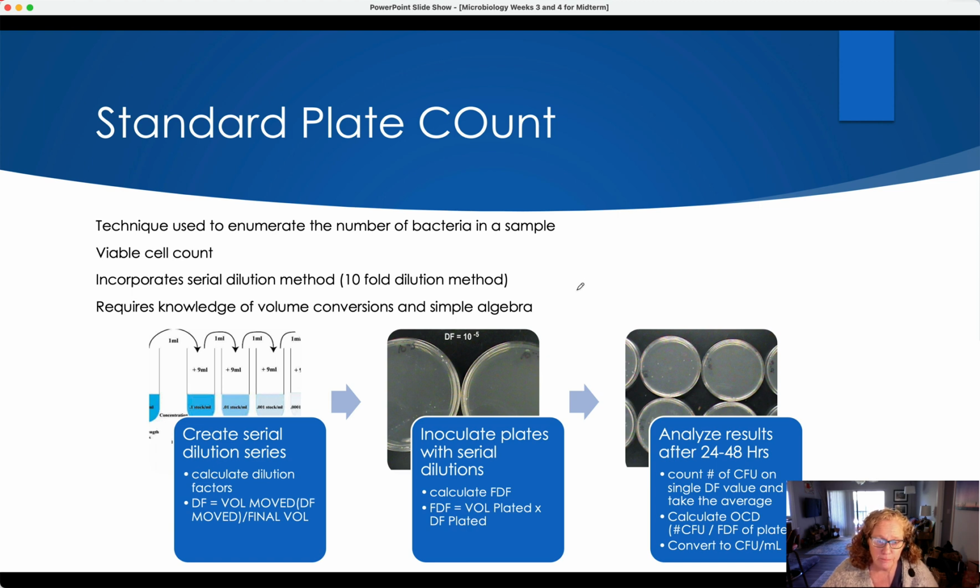dairy industry. So some of the standards and numbers that we'll be talking about in this particular recording are, again, referring to the dairy industry and the microbial count for raw milk in order for that milk to be considered safe for pasteurization.